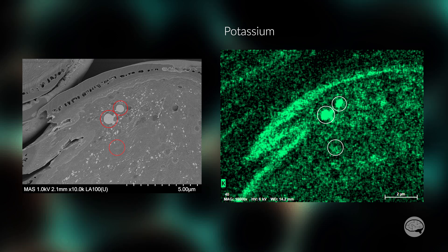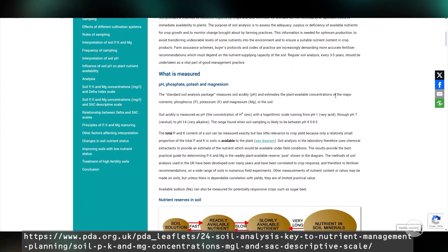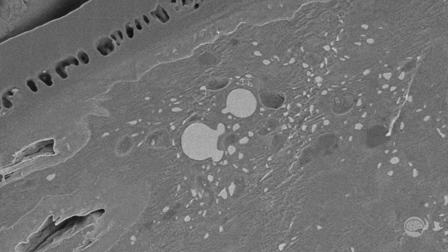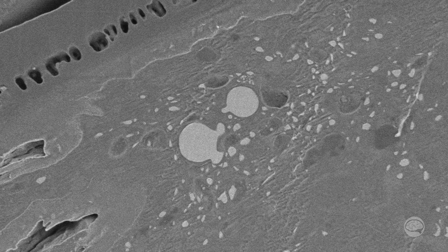So what does that mean? What do all of these elements make? I have no clue — I told you I'm not a botanist. But the Potash Development Association from the UK states on their website that phosphorus, magnesium, and potassium are the three main nutrients involved in plant growth and something you should test for in your soil. So does that mean that these spheres are tiny bits of fertilizer that the new plant can use if it's germinated and starts growing? No clue, but I'm sure some botanists can chime in here and let us know.